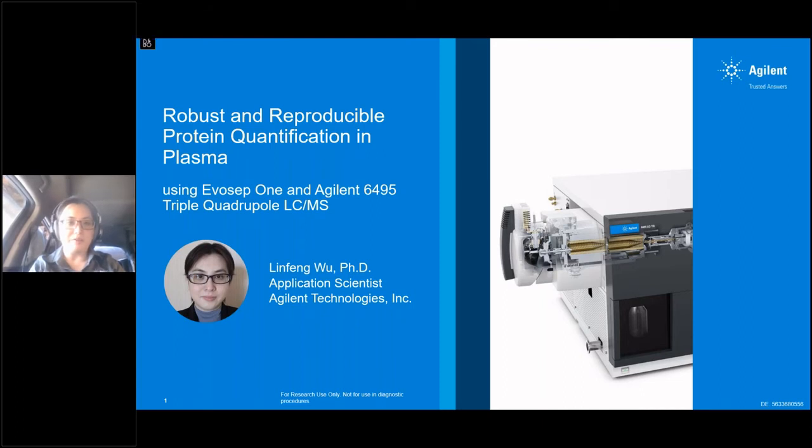First, I would like to thank you for inviting me to present our work on protein quantification in plasma using Evosep One and Agilent 6495 triple quadrupole LC-MS.